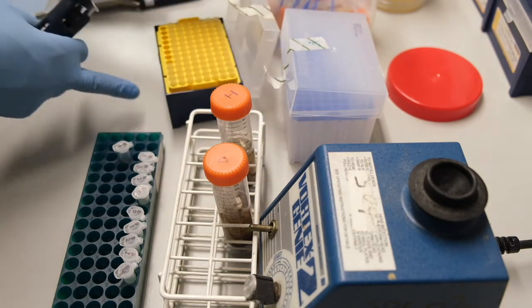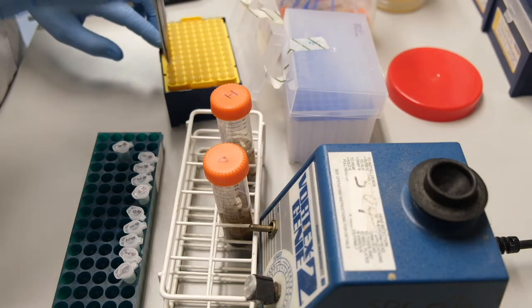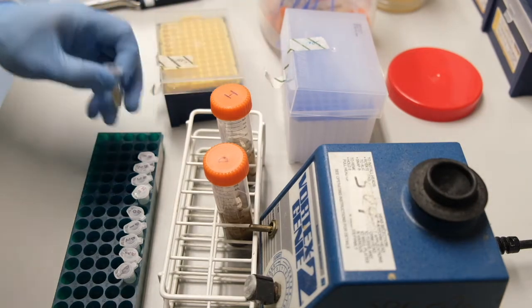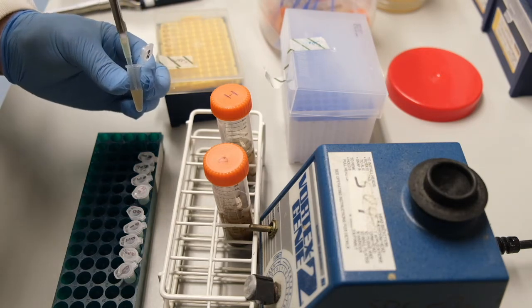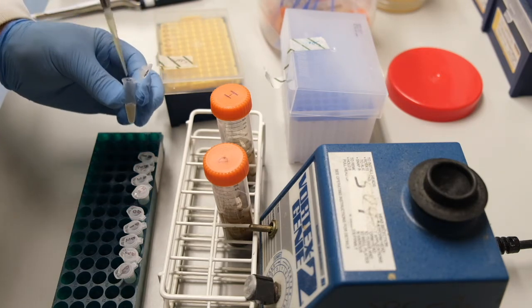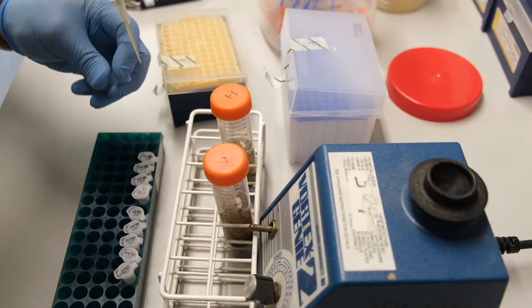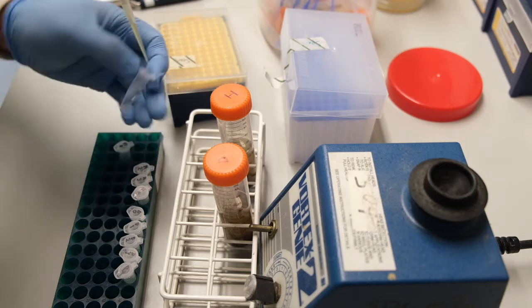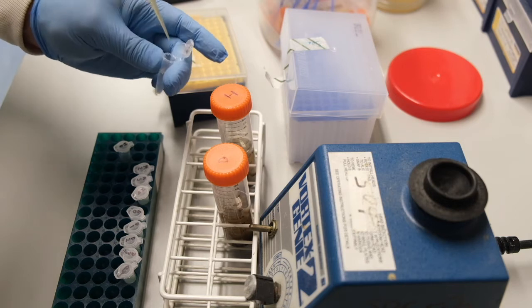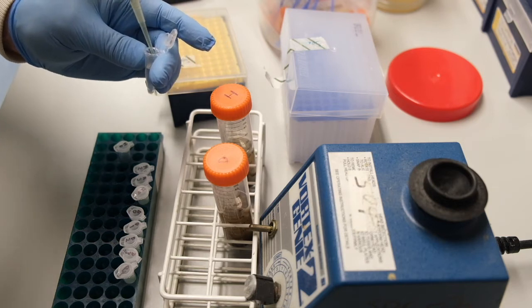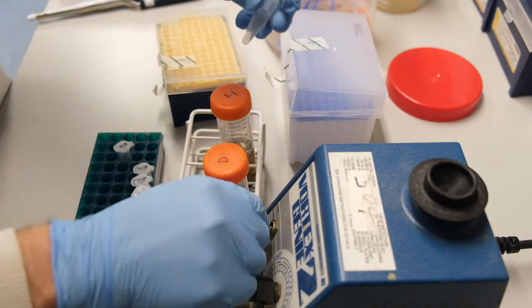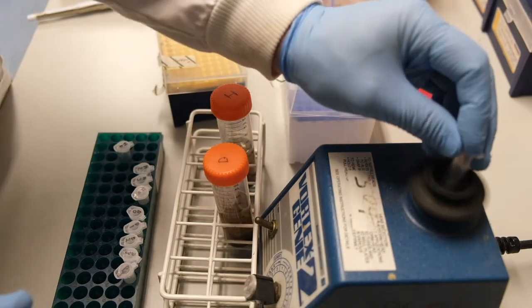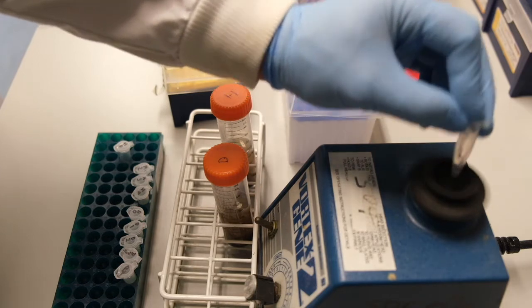Using a P200 set on 100 microliters, we take 100 microliters of the undiluted soil sample and transfer it to our 10 to the minus 1 dilution tube, where it will be mixed with 900 microliters of ringer solution. Vortex thoroughly to mix.